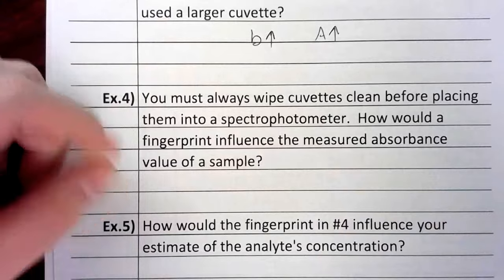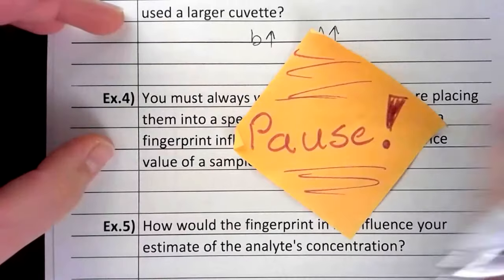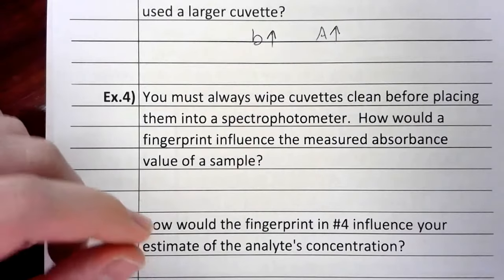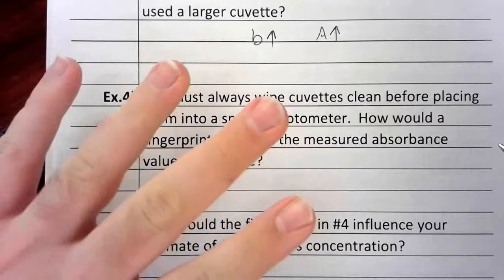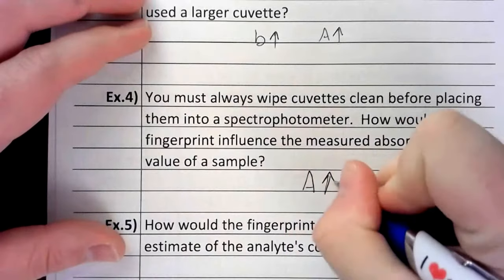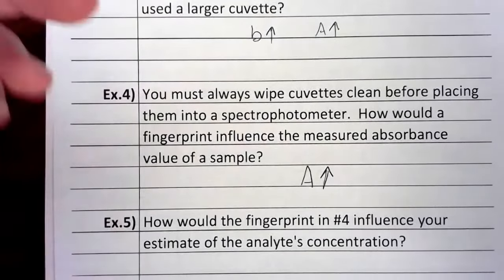So take a guess on number four. How would a fingerprint mess with this? Very simple. Same way a fingerprint messes with light as it travels through a piece of glass. If I put a fingerprint on something, it's going to block some of the light. So the immediate effect of that is that absorbance would go up if there was a fingerprint on the cuvette. So it's important to always wipe them.